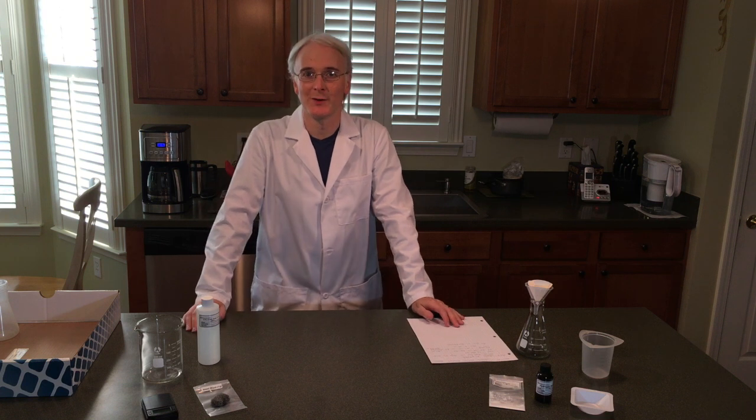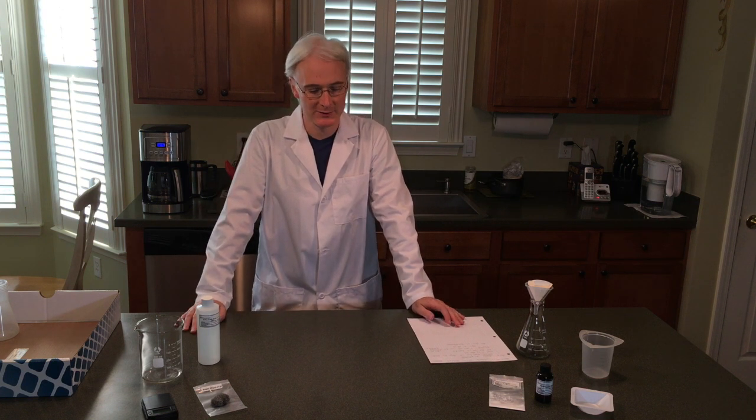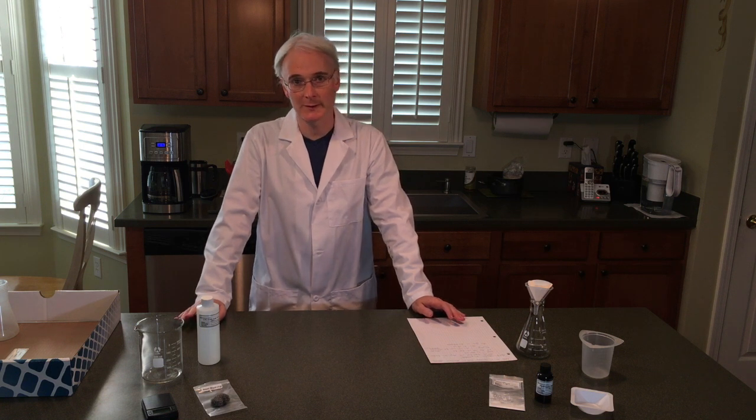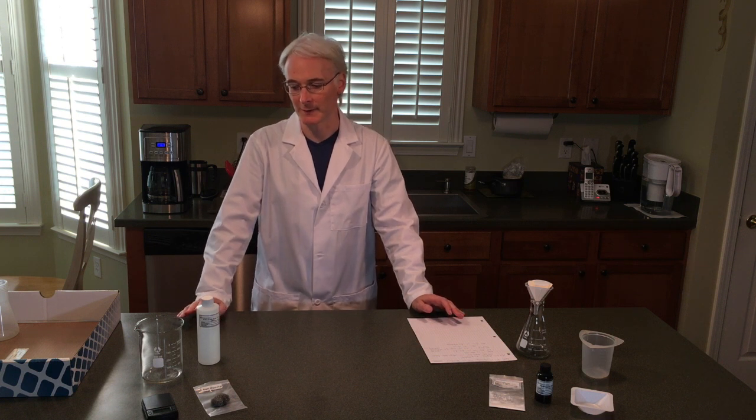Hello again and welcome to Lab 21. This is Oxidation Reduction Reactions, or Redox. There are a couple of stages to it and it will take quite a while to work your way through the lab, so let's get started.